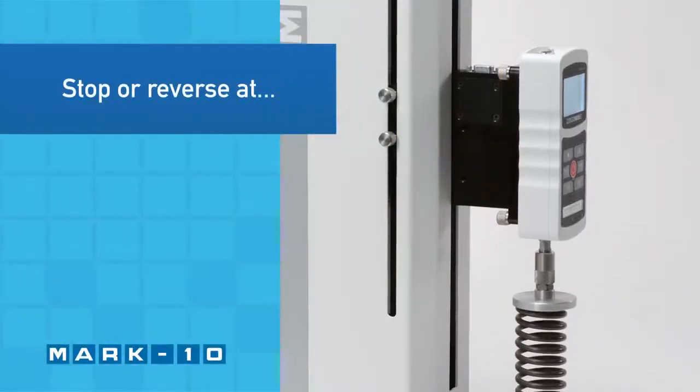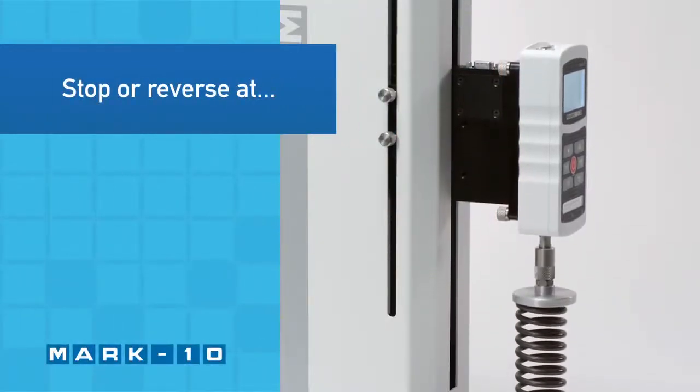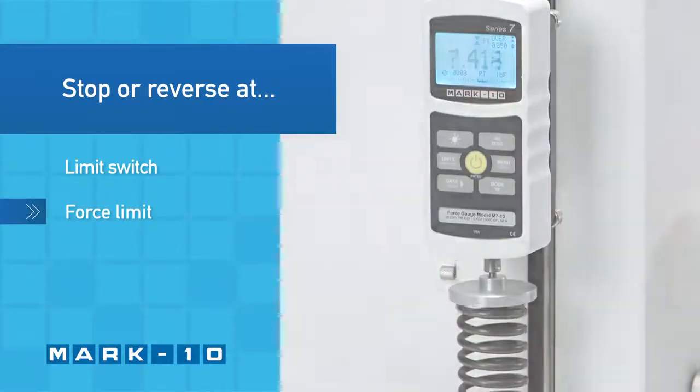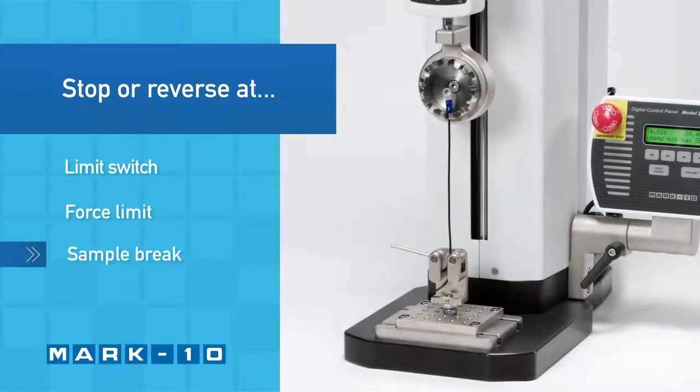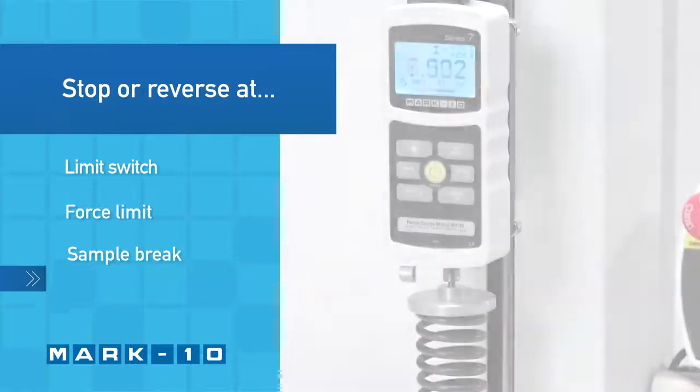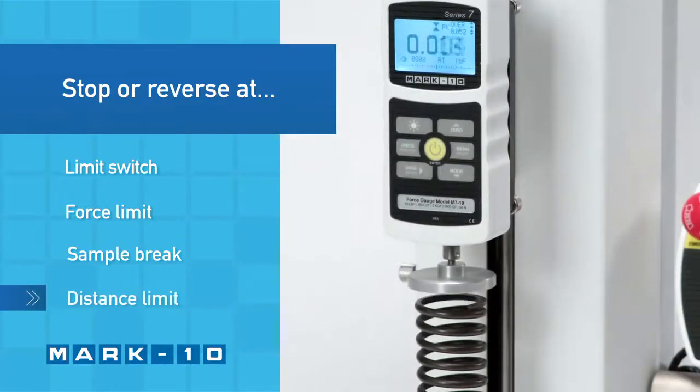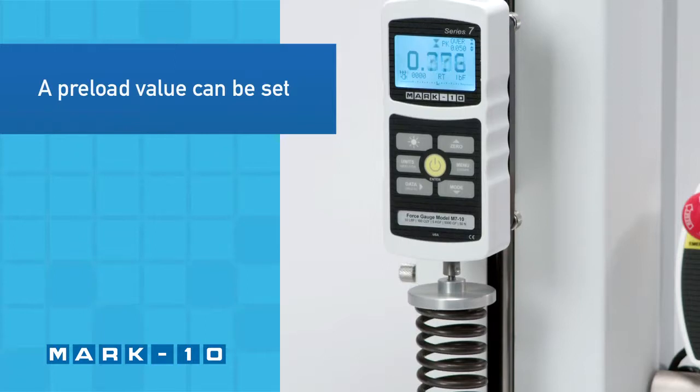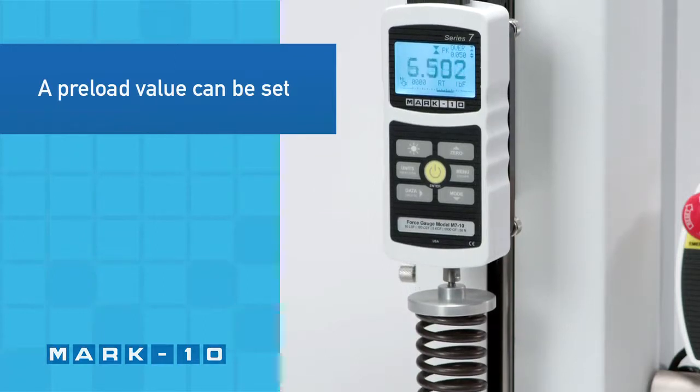The test stand can be configured to automatically reverse or cycle between limit switches, when reaching a force, when the sample has broken, or when a distance limit has been reached. A pre-load value can be set to automatically zero the travel display at initial sample contact.